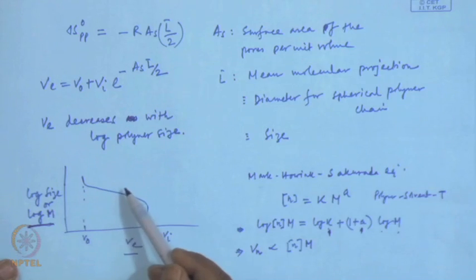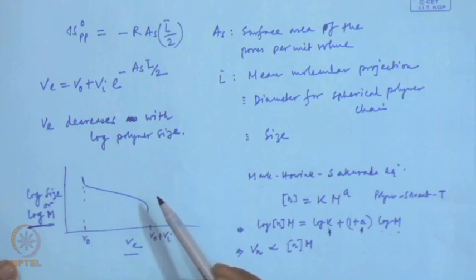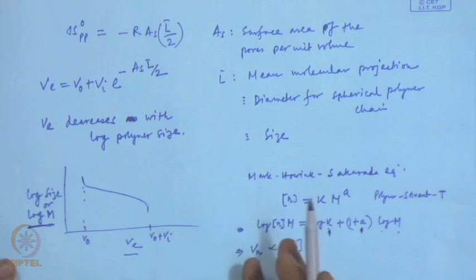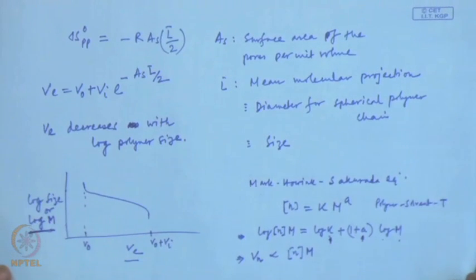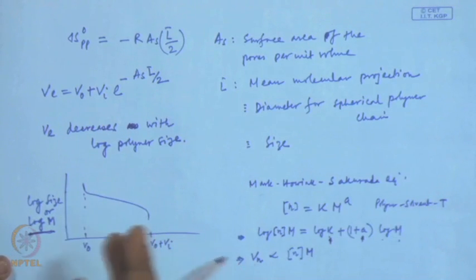most of the time we use one set of calibration curve for a lot of other polymers, which gives us maybe 0 to 30% error in terms of molecular weight. The reason we cannot get a calibration curve made for all polymers is that we cannot get narrow dispersed polymer for all types of polymers, especially for condensation polymers like polycarbonate, polyesters, polyamides.